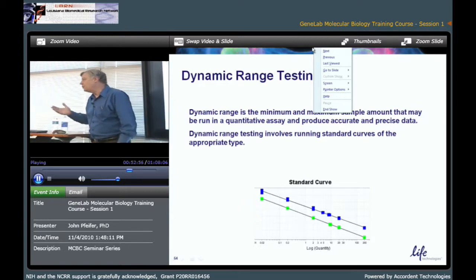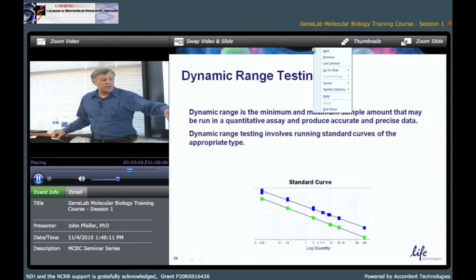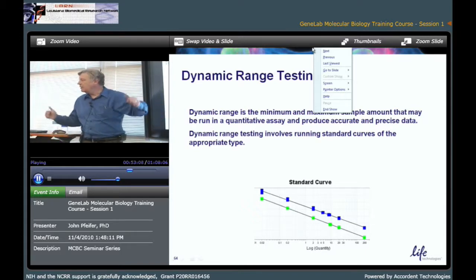Now, obviously, with the human DNA, we don't have to worry about reverse transcription. That's irrelevant. But we do have to worry about inhibitors. That's an ever-present concern. But then once I've identified, oh, look, there's no inhibitors, yay, now I can go straight into data production using Delta CT.